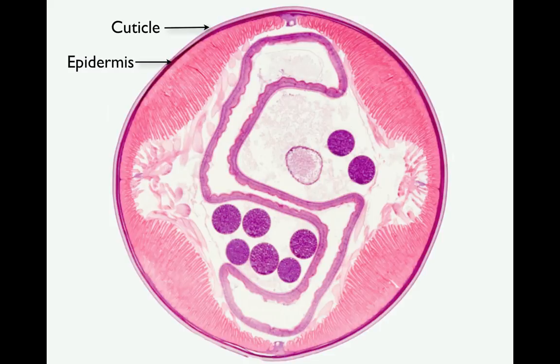The red area that you can see is muscle. There is only one layer of muscle in roundworms, and the fibers run the length of the body, and so are referred to as longitudinal muscle. In a living specimen, this layer would not appear so thick. This appearance is the result of making a thin slice of the specimen, which leaves the fibers hanging loose.